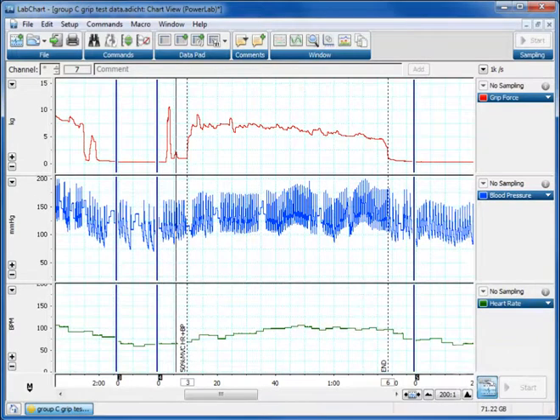Hi, it's Dr. Clark here, looking at LabChart, going through some very simple tutorials showing you how to access your data and analyze data.